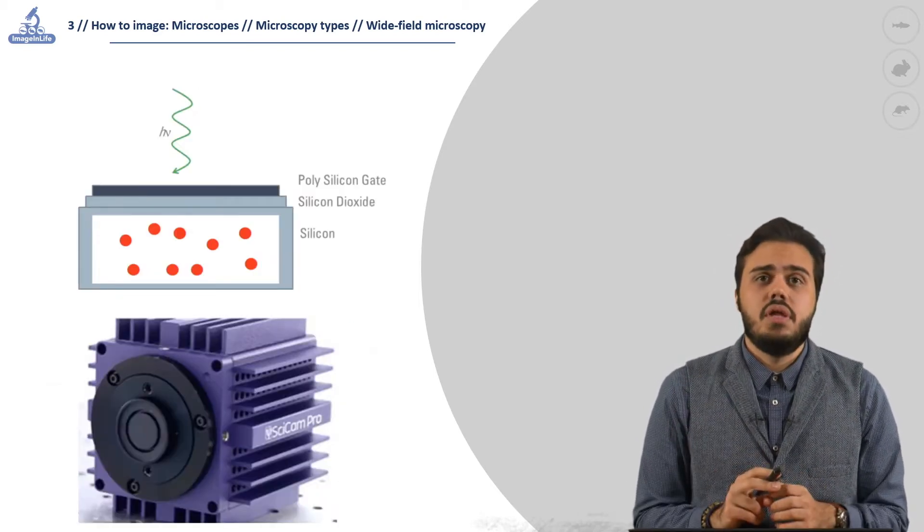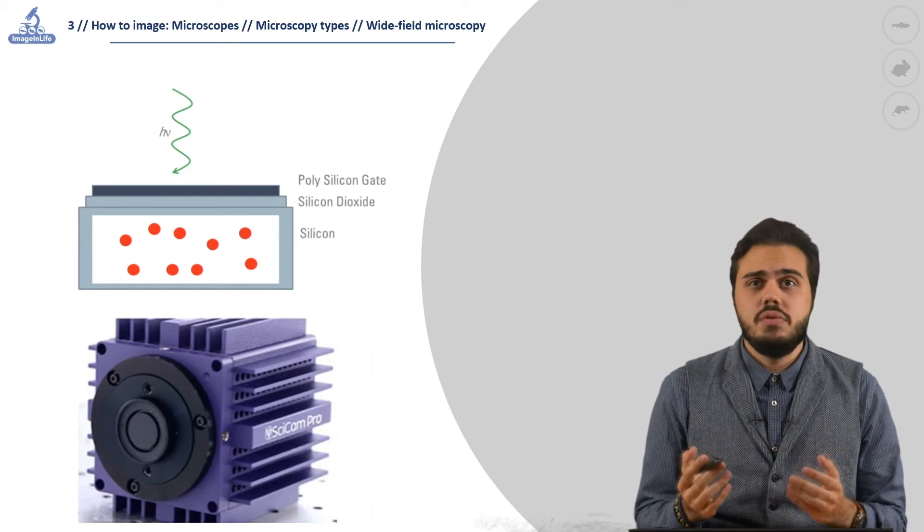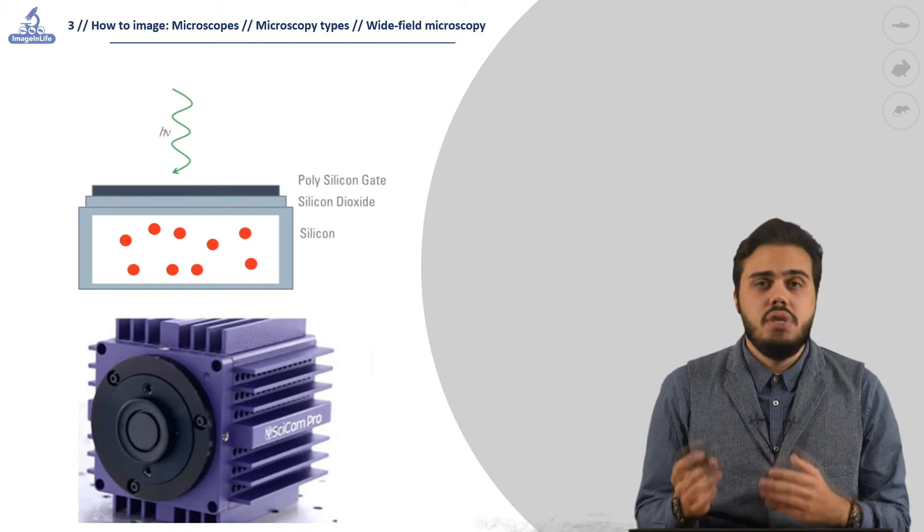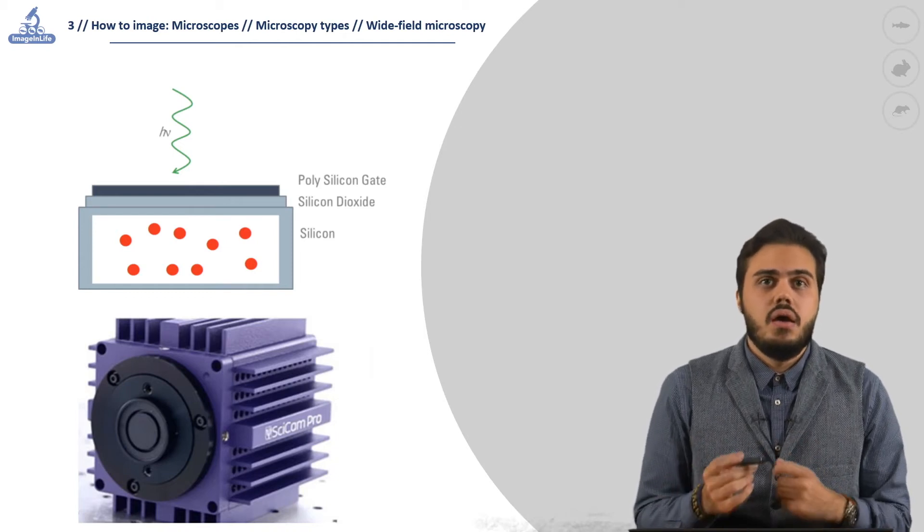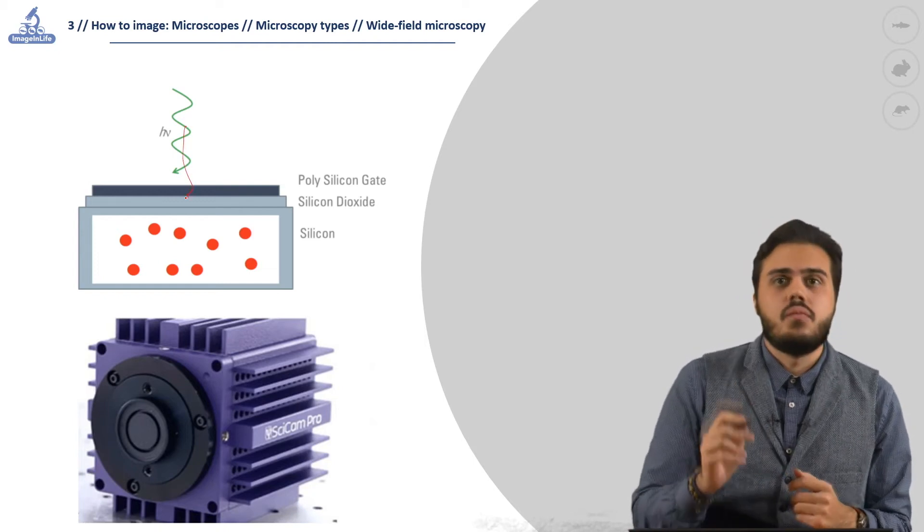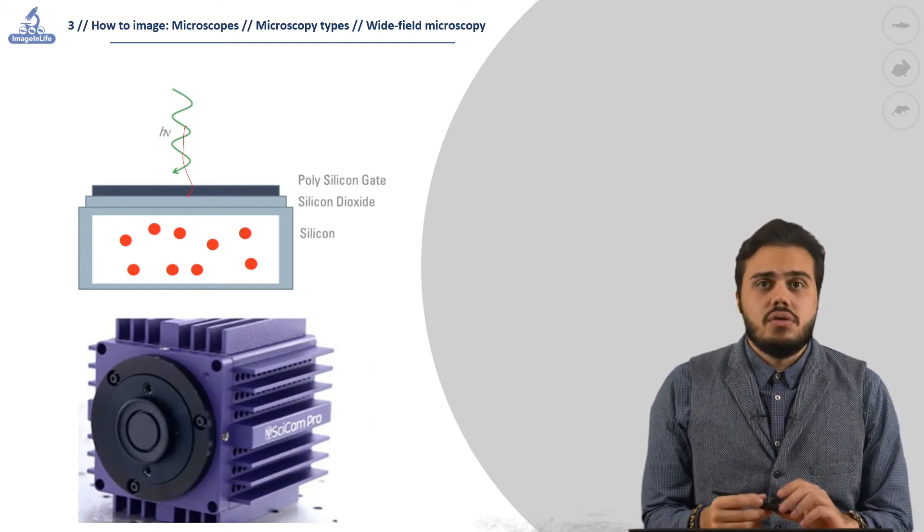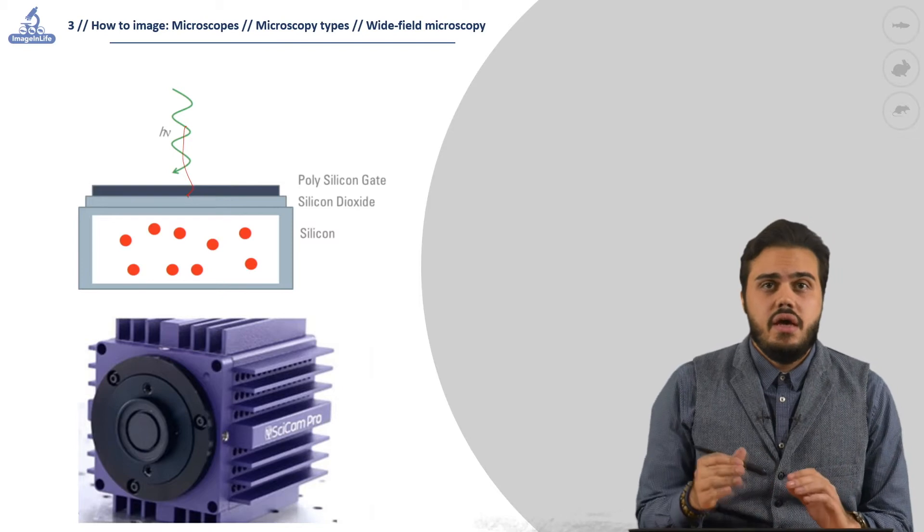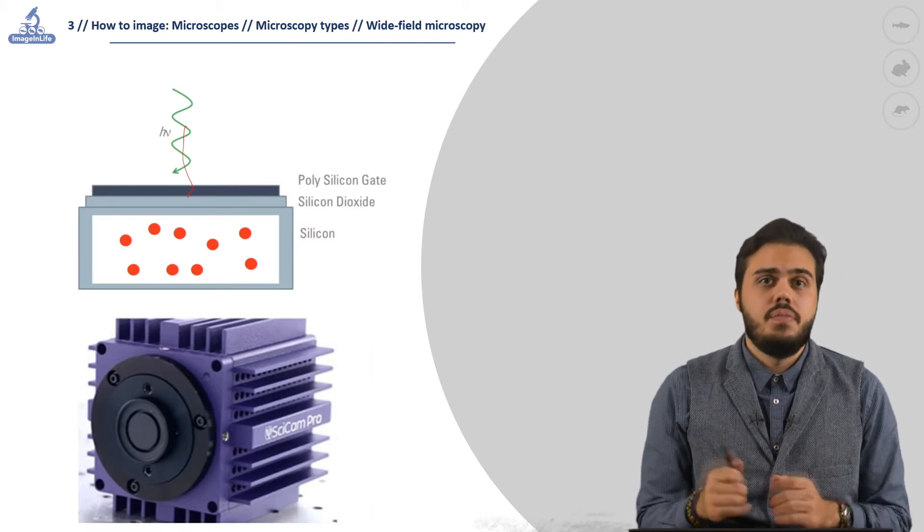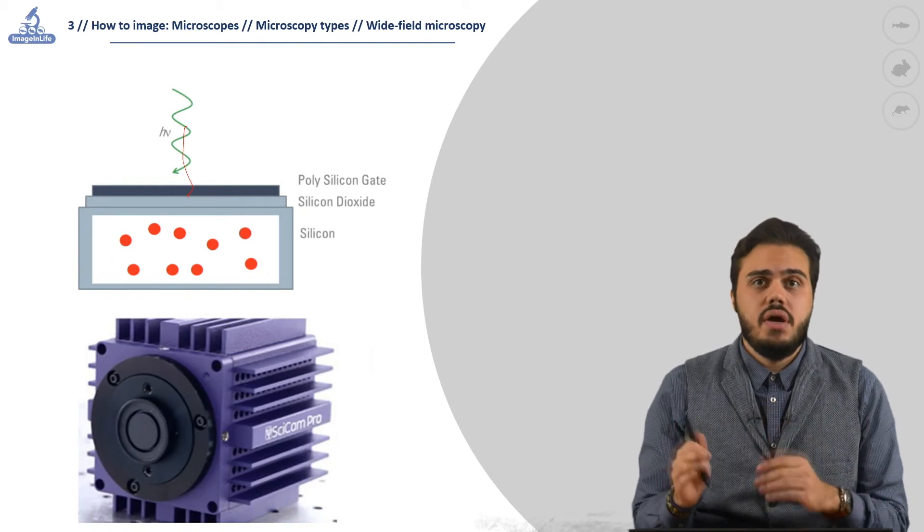Another fundamental component of modern microscopy is the camera. The camera sensor in general has millions of photodiodes that convert light into electrical currents. The most common semiconductor sensors are the CCD and CMOS that differ only in frame rate, noise-to-signal ratio, and sensitivity.